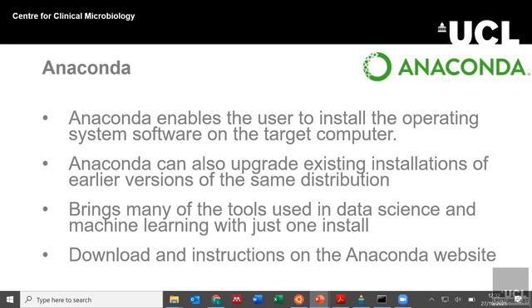So it helps to bring everything together, and it stops you from installing one thing and not having the correct version of another thing that you didn't necessarily even know you needed. And I know that there are other ways to do this, such as Docker, but I've explained a bit more in the PDF about this. I've certainly found that Anaconda is quite useful for installing programs and making sure you've got everything that you need.